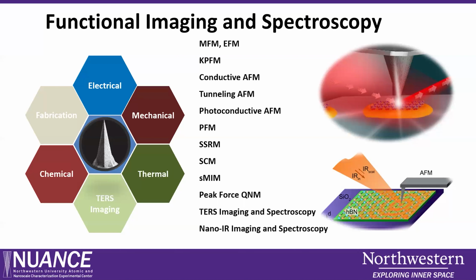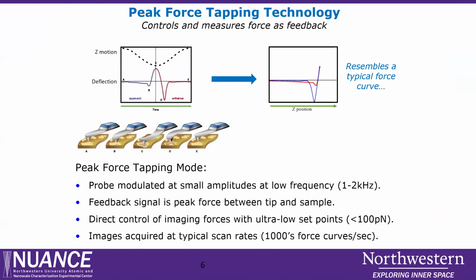I'll be talking about the different components: Kelvin probe microscopes, conducting AFM. You can see here a list of different techniques that are available within our facility, and some of them may be installed in a couple of weeks. Going through the basic principles, peak force tapping is mostly used in almost all of these techniques.